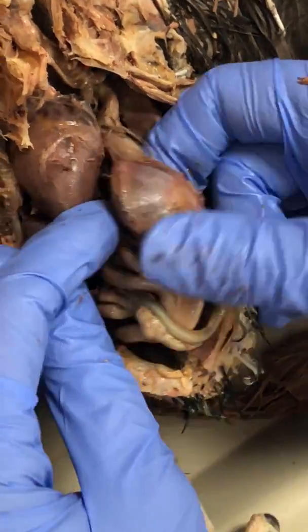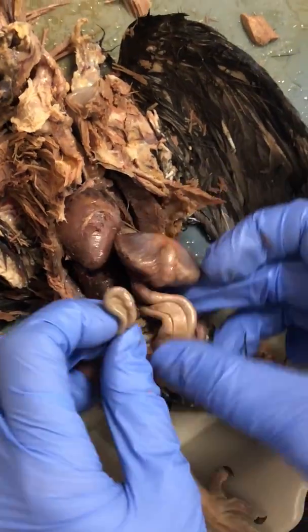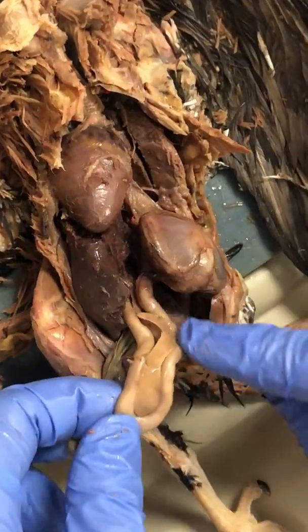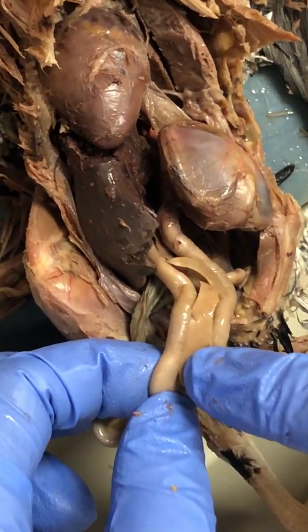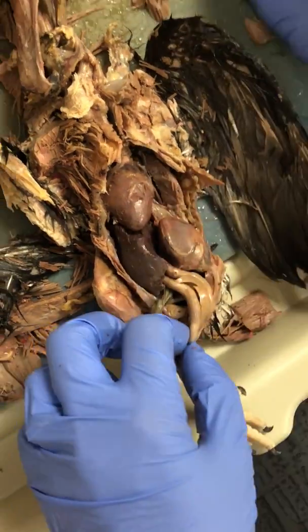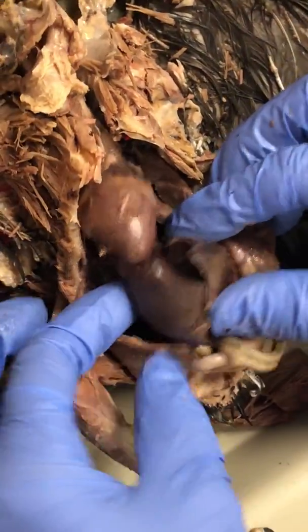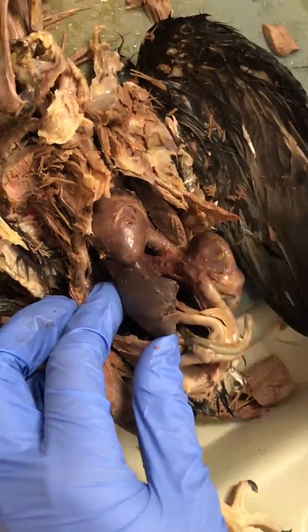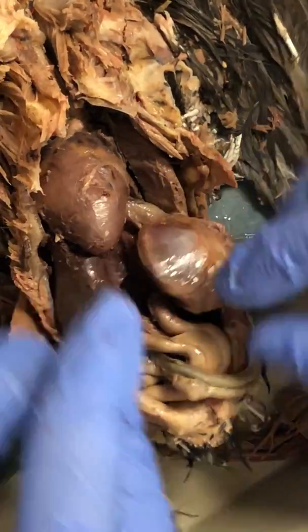The gizzard releases food once it's been digested into the first part of the intestines, the duodenum, and it's actually lining the pancreas, which is this structure right here. We've removed the liver — this large structure here is the liver — which gives us a view of the proventriculus, the gizzard, and the intestines.